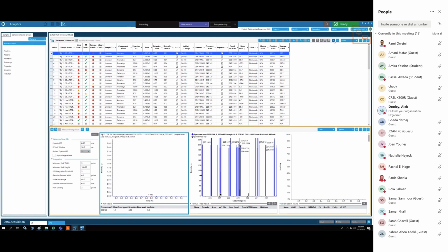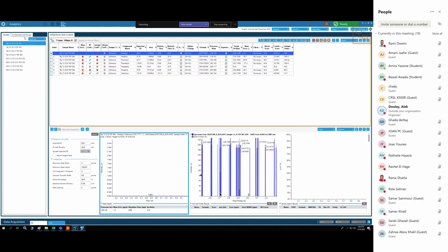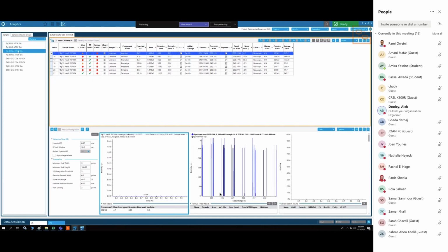So how can we go quickly to the samples that have spike? Right? To do that, we can go to the samples tab. We can go directly to the B. So we need B samples. Sure. We don't see. So what sample?